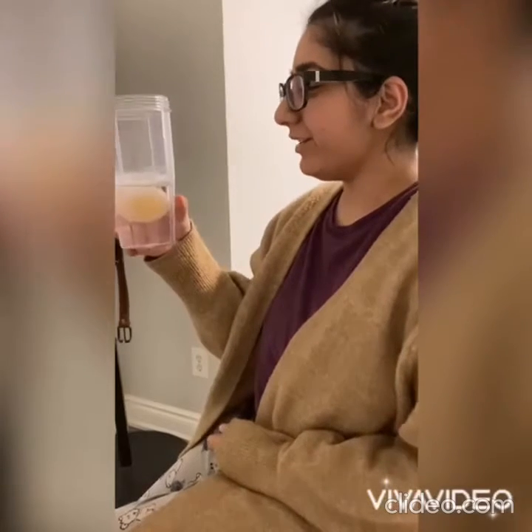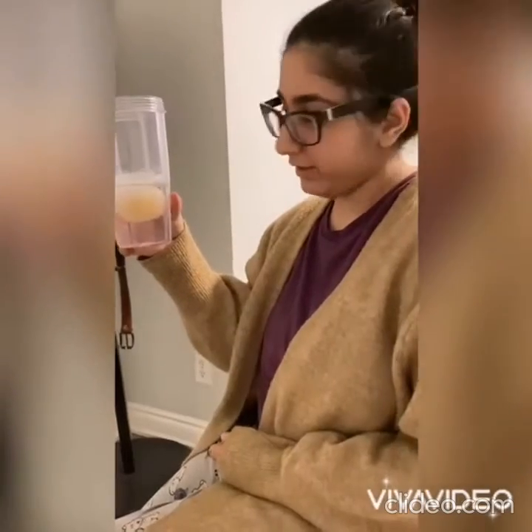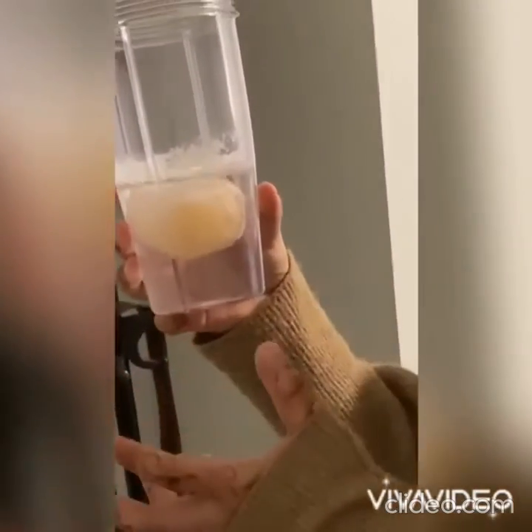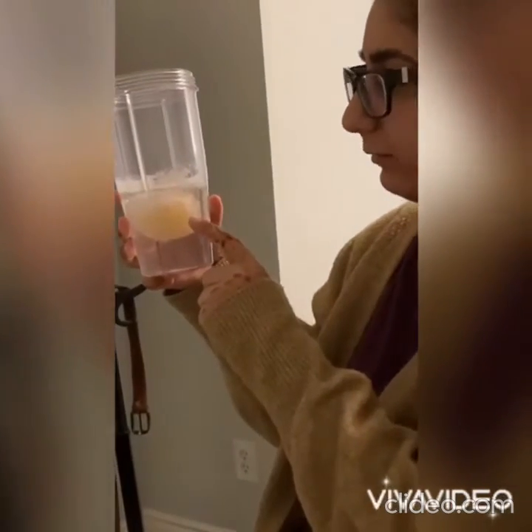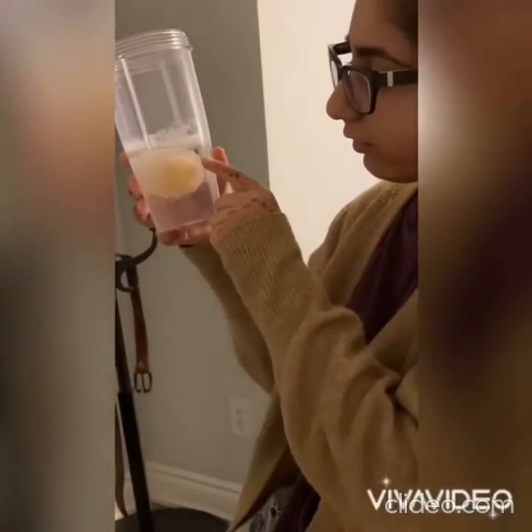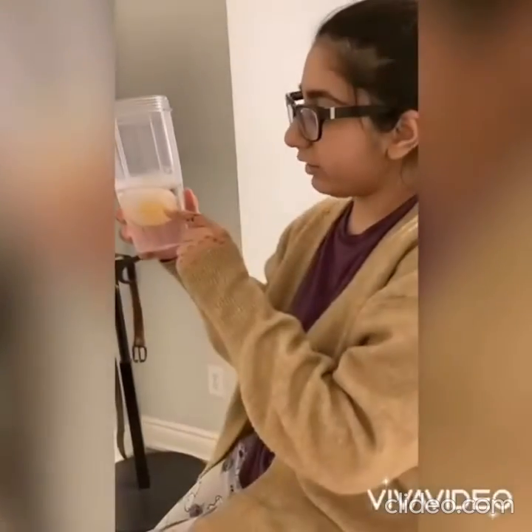Hi, here's the egg after 24 hours and we can observe some of the physical changes that have taken place. First, we can see that the size of the egg has increased and it has expanded in volume. Next, we can see that the shell of the egg is disintegrating. We can see this cloudy texture forming, and we can also observe this almost translucent membrane of the egg that is starting to appear.